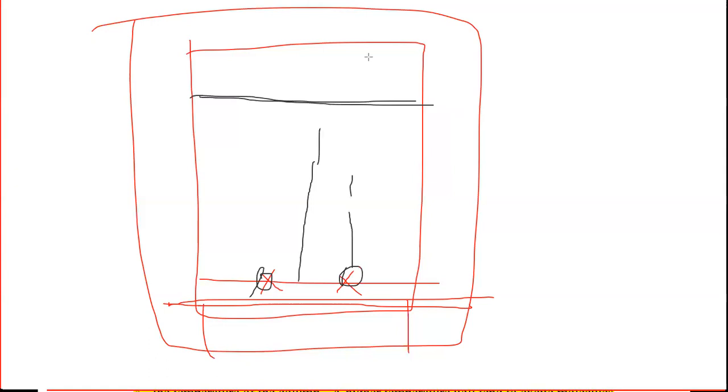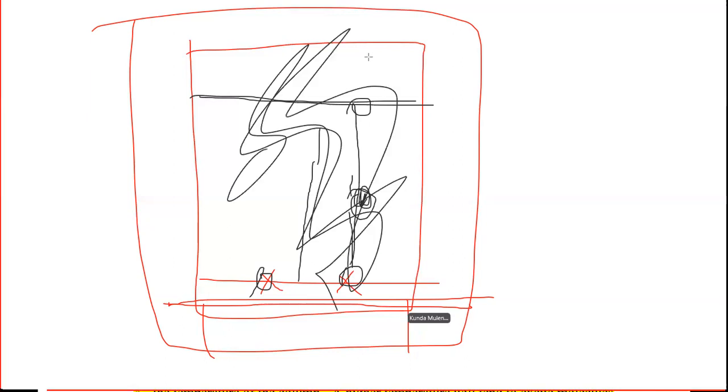These things here can never, at any point, go beyond the level of the solvent. It can never. So I'm saying you as a passenger cannot get to the destination earlier than the driver. It's not possible. So there are only two things that are likely to happen. Number one, the solvent front moves the same distance or the component moves less. So this is what brings about the retention factor. Retention factor also is dependent on the interaction between the sample and the wall of the filter paper.